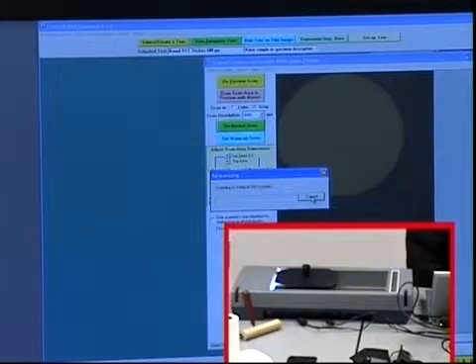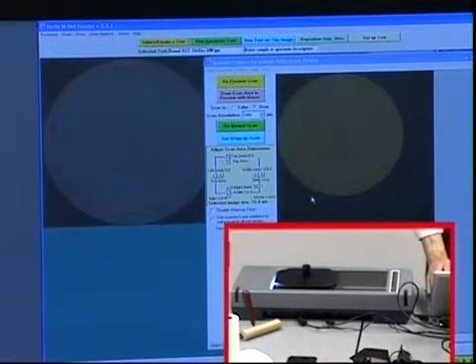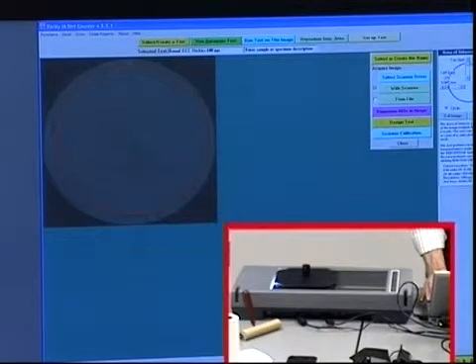This is a very simple test. It is not as involved as running on the POLMAC, and it gives some of the results that a POLMAC would yield. It is sensitive only to those low melt point waxes that will melt in the hand sheet dryer. We'll center the area of interest, eliminating any edge effects, although we do have a nice fat sticky at the top.